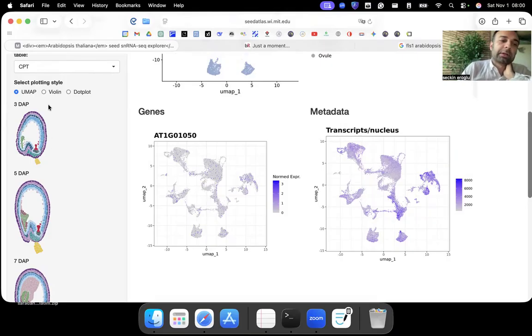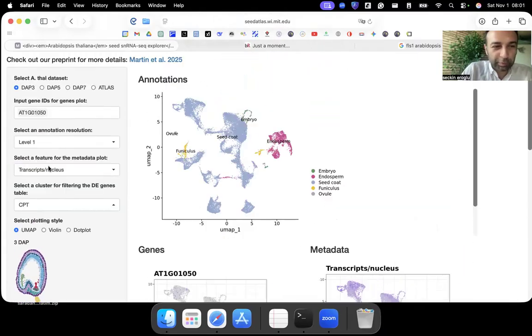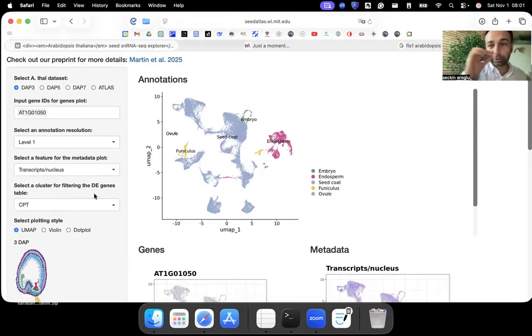They used the reference genes, marker genes, to associate with the tissue. I don't know if it sounds clear or not. Yeah, they did RNA sequencing for nuclei for each cell.